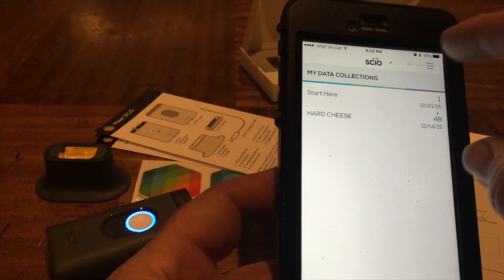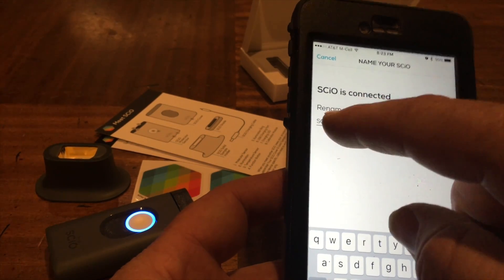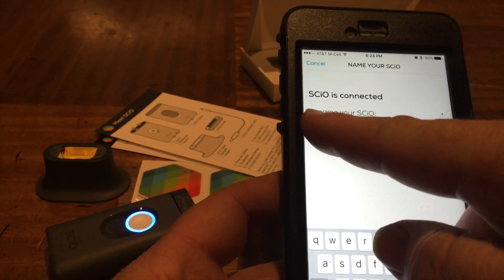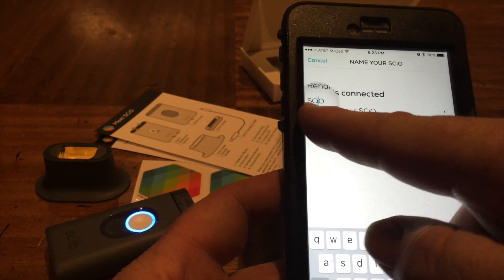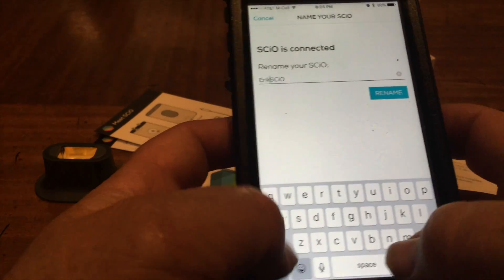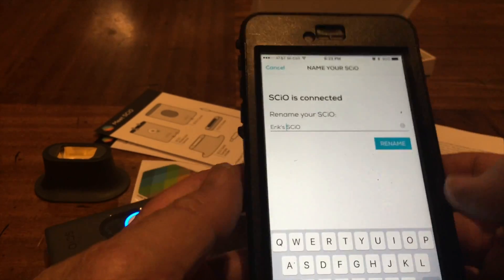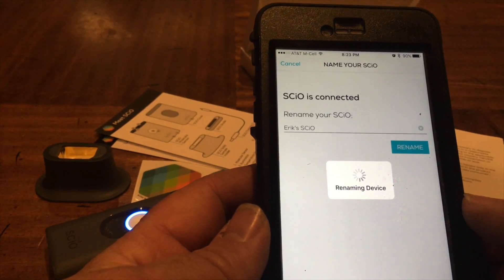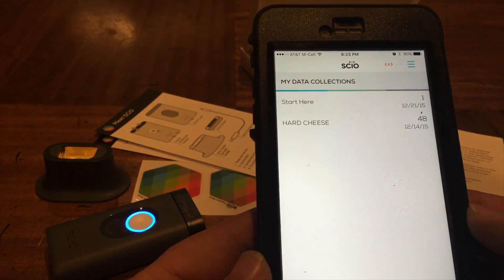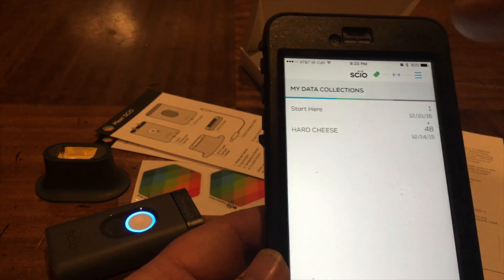Let's try that again - rename. Come on. There we go - Eric's. It takes this renaming thing pretty seriously. It disconnected and then repaired and everything.